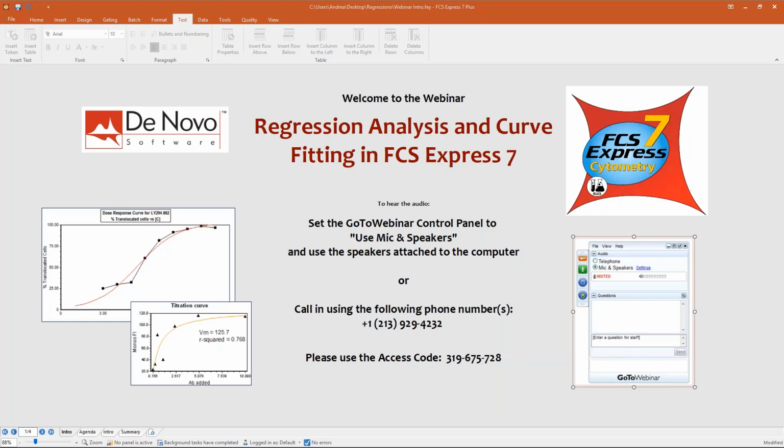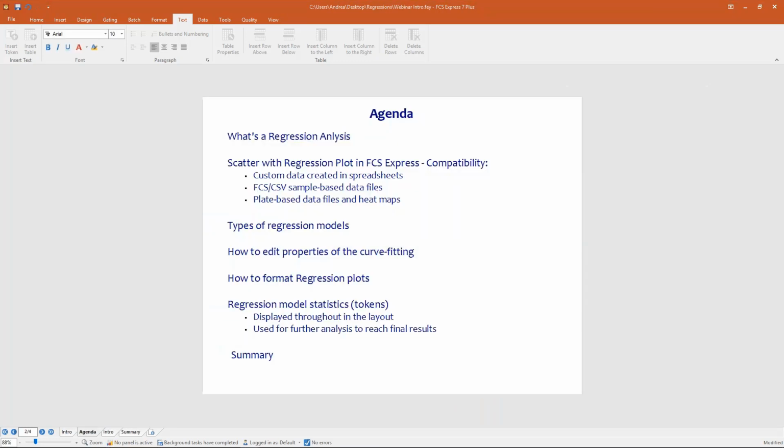So hello everyone, and thanks for joining me today for this webinar on regression analysis and curve fitting in FCS Express 7. I want to go straight to the agenda. So what we will see today, this is the summary.